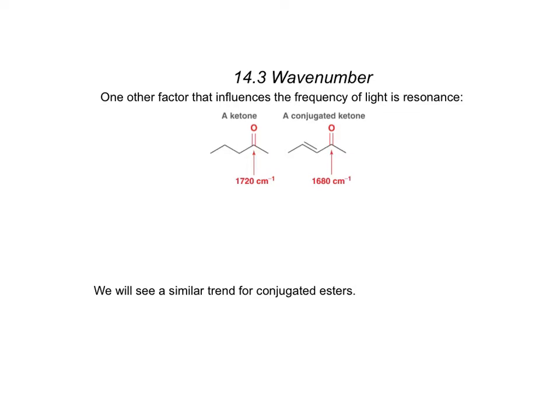And we're looking in the double bond region of the IR spectrum, the diagnostic region, and we're seeing a signal for that ketone where we would expect it. And we compare that with the conjugated ketone, same exact bond that we're looking at, carbon-oxygen, so mass isn't going to affect anything, and we're seeing it at a little bit lower frequency, right? So a little bit lower frequency, a little bit lower energy. Why do you think this is?